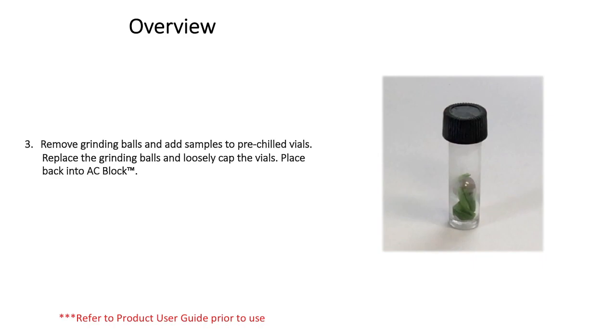Remove vials from the AC block, pull the ball into the caps, and unscrew. Add sample and then replace the stainless steel grind ball. Screw on the line caps and place back into the AC block. Repeat until all vials are loaded with sample. Minimize the time vials are out of the AC block.